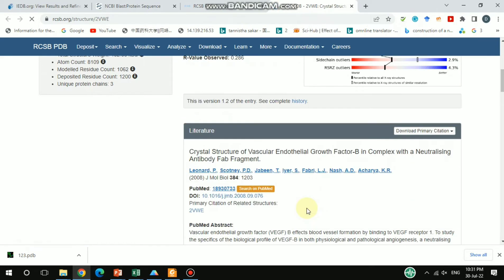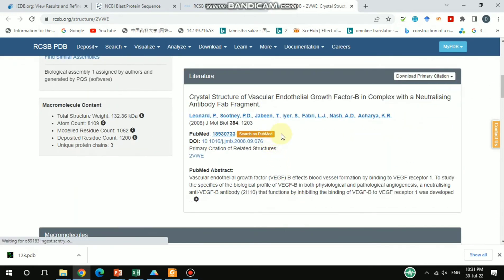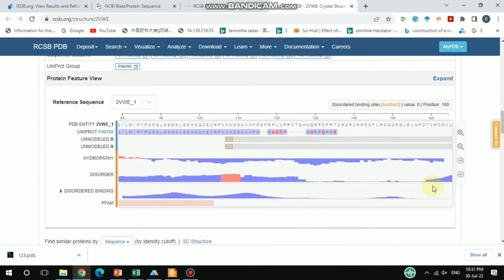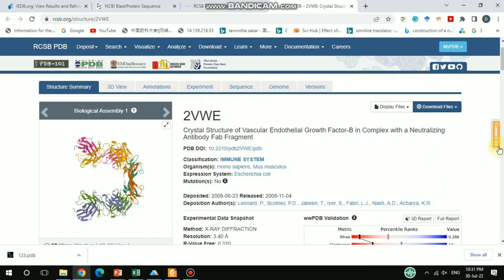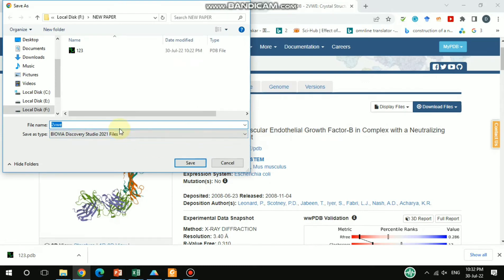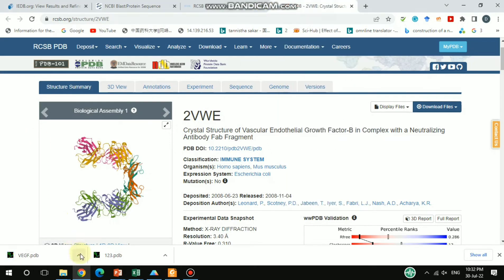From here I'd like to get the crystal structure as a PDB file. If you would like to read the paper in detail you can search on PubMed, but going further you can get detailed information. This shows the VEGF A and V chains with some additional information. I'd like to download the PDB file from here in PDB format, then I'll open it in the PDB software.